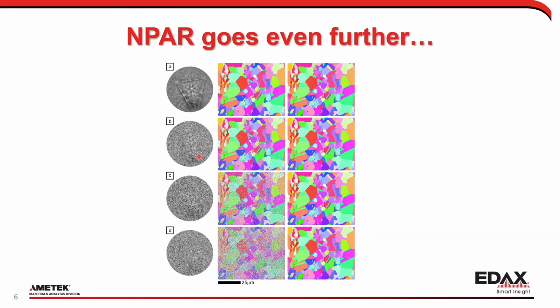But again, you can see down here, like on C and D, there's no information here that you guys can see, but the computer can actually basically fully index this material. It can do a good job on the fly, but post-processing wise, it can do even better and basically get you a perfect map. Again, there's really no difference here between A, B, C, or D with the final product. But again, you have to really learn how to trust this Hough Transform.